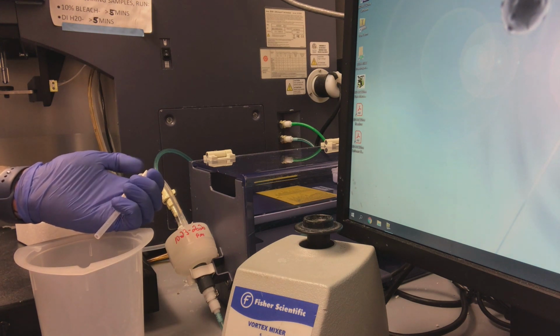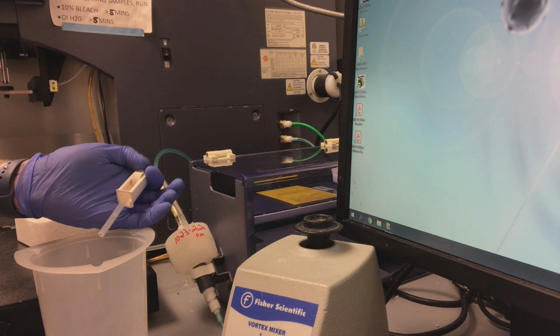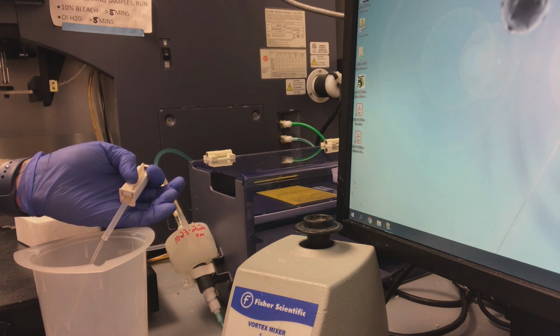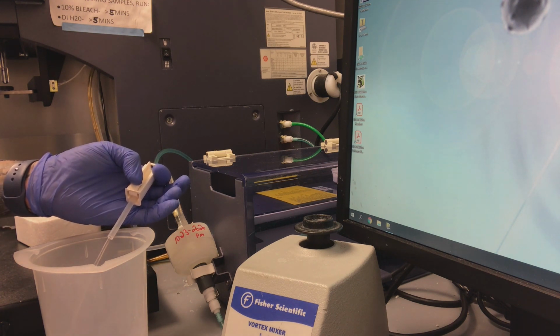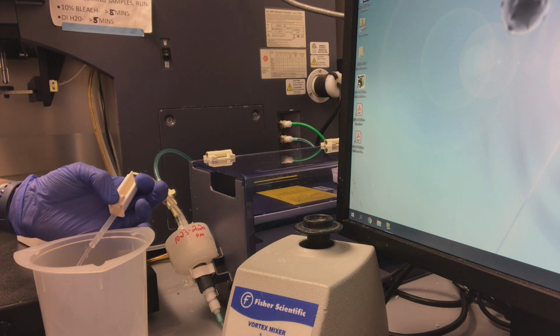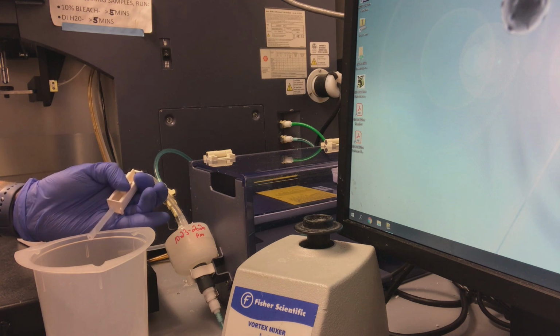In order to bleed the filter, there's a roller which just rolls down, and liquid will come out into the beaker here. Allow this about 5 to 10 seconds, or until you do not see any more air coming from the filter. Then you can roll this back up into place.